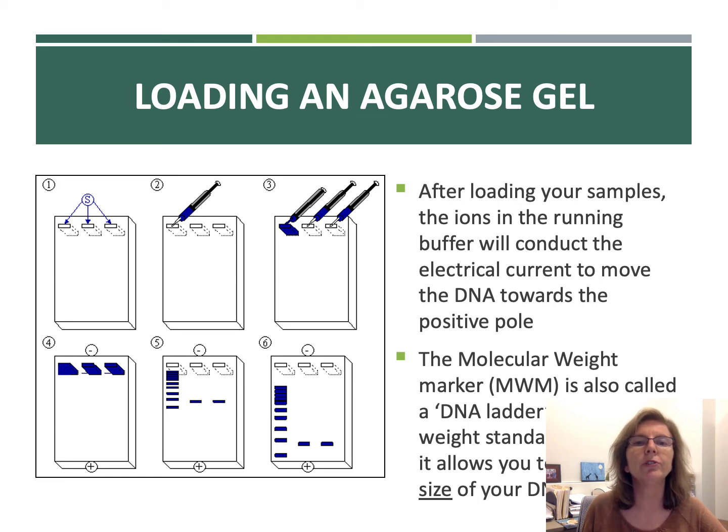So after you've loaded your samples, the ions in the running buffer are going to conduct the electrical current to move the negatively charged DNA towards this positive pole, which is at the bottom.